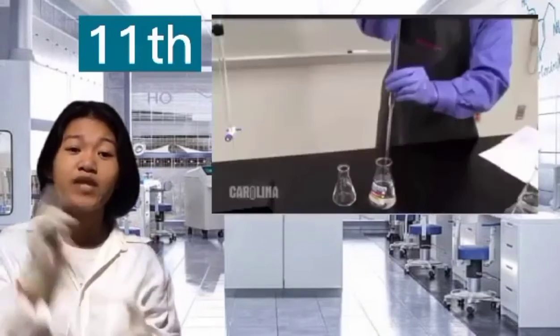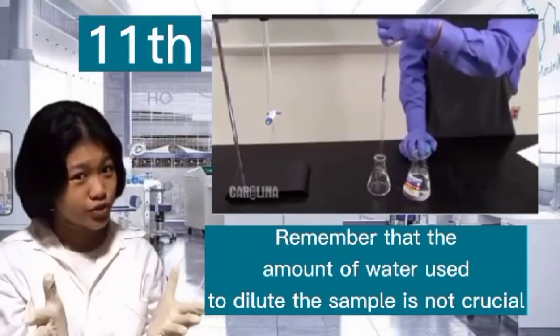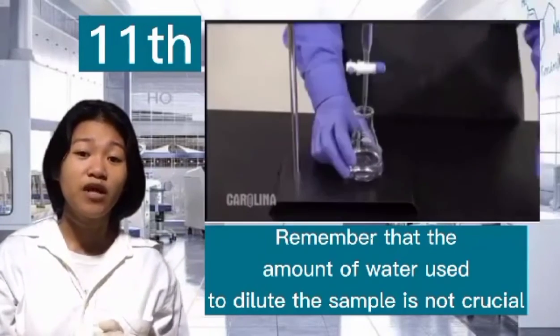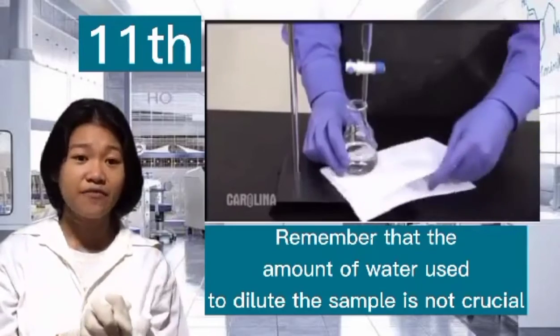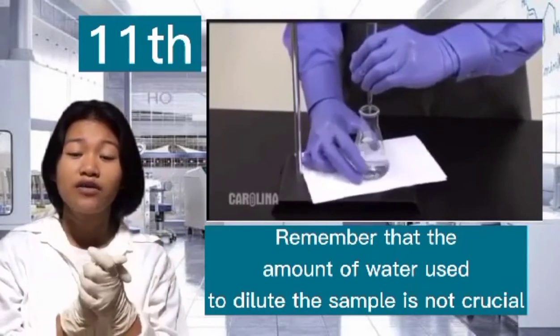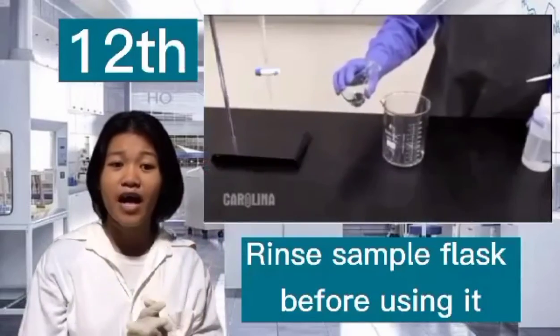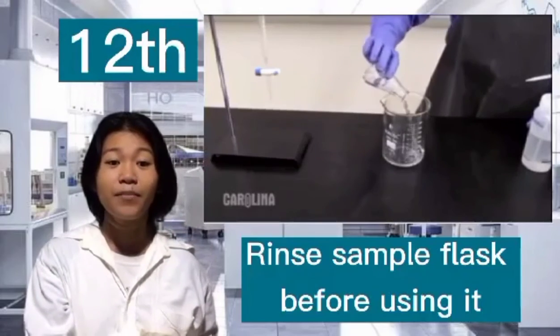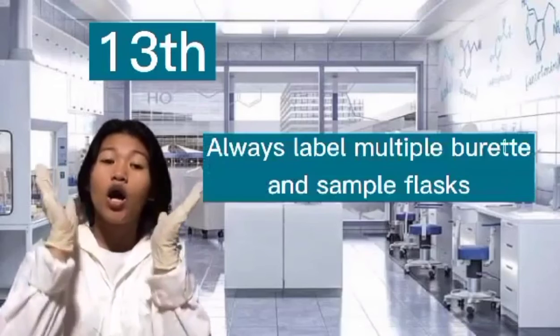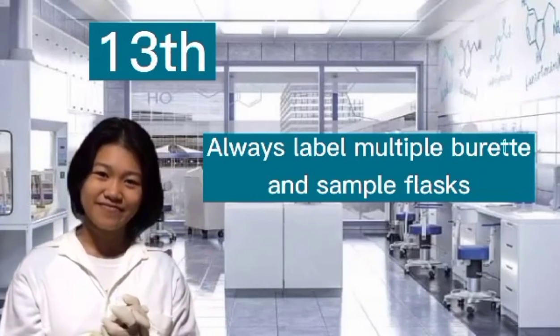Number 11. Remember that the amount of water used to dilute the sample is not crucial because it does not affect how many sample molecules are present in the flask. Diluting with water allows you to see the color change easier. Number 12. Always rinse the sample flask before using it. Number 13. Always label multiple burettes and flasks.